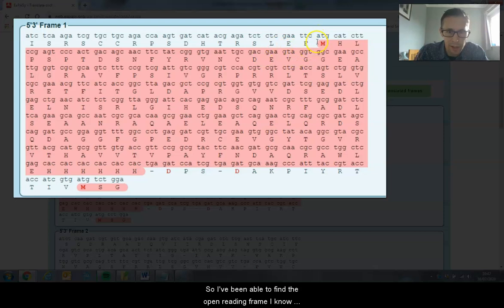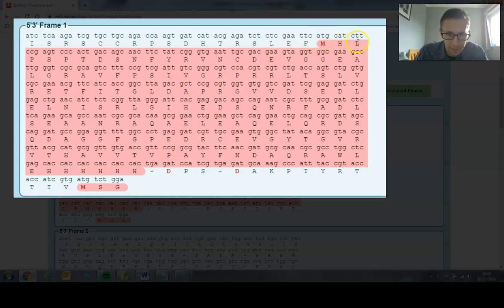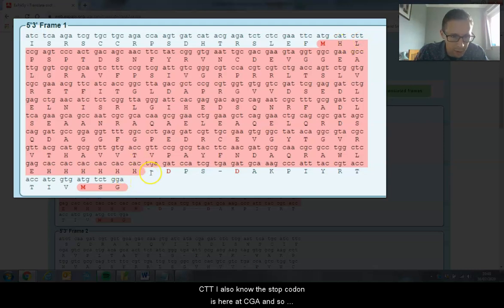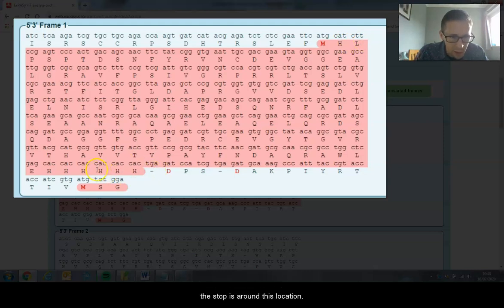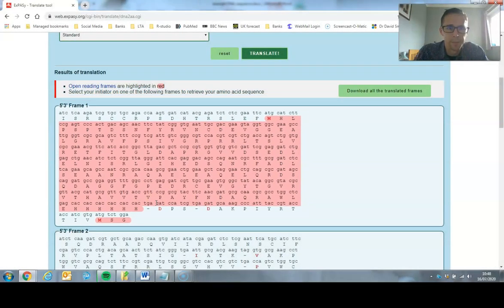I know that it starts ATG CAT TCC TT, and I also know the stop codon is here, TGA, so the stop is around this location.